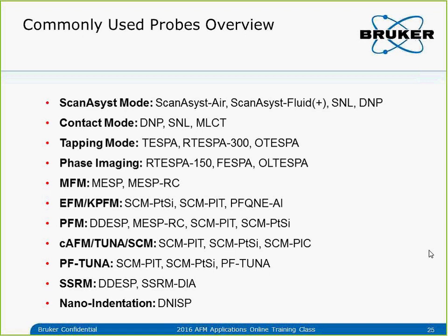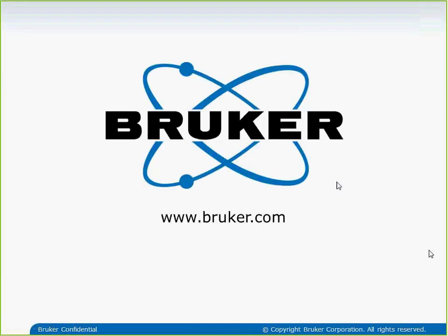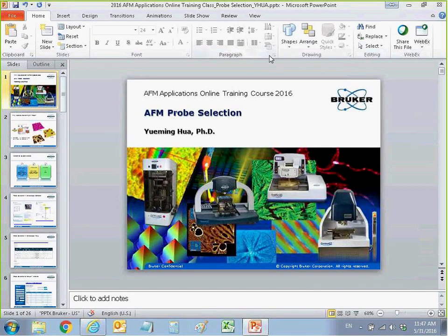Okay, I think that's all about our probe. To finish today's session, I just listed the commonly used probes for different modes, like the basic imaging modes and some application modes. And we have some time, so I can take some questions if you have any.